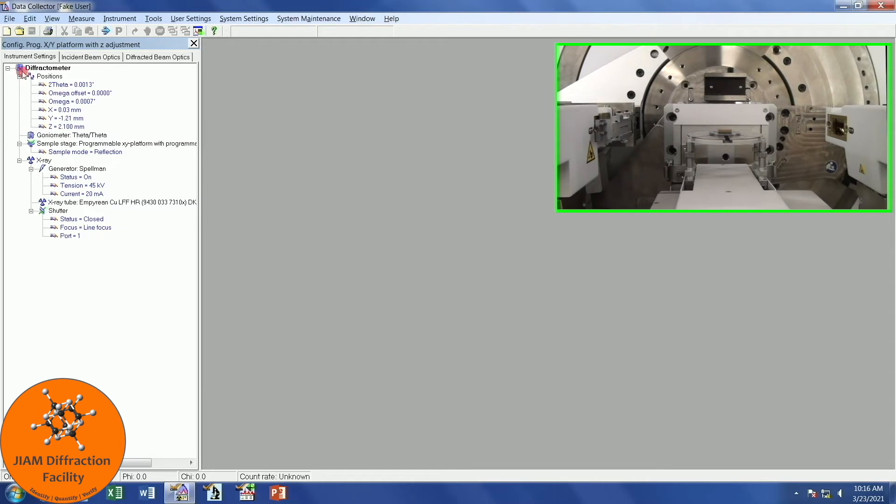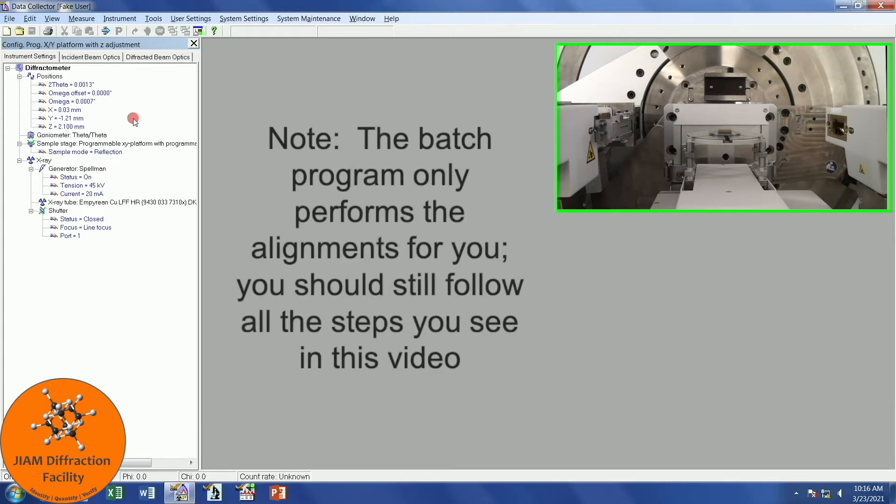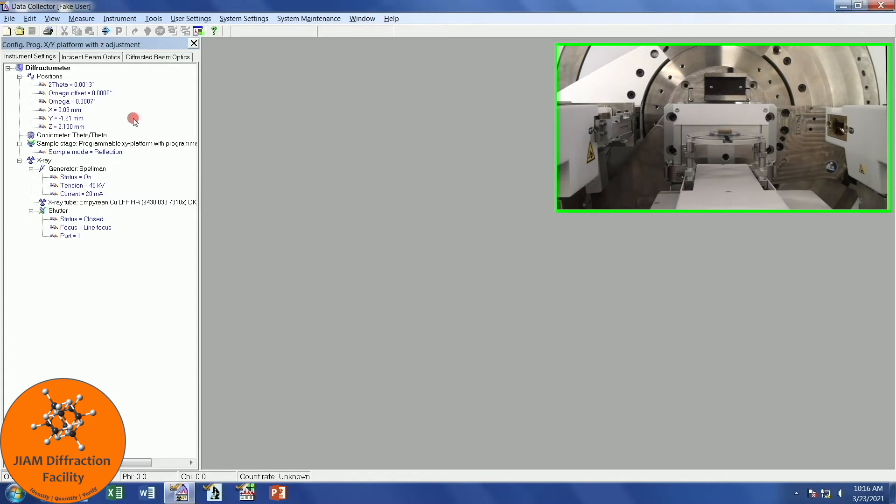Here we see three tabs: Instrument Settings, Incident Beam Optics, and Diffracted Beam Optics. This first tab, you may or may not even need to do anything with this. What I am going to show you here in this video is how to perform alignments using a batch program that carries out all of these steps for you. I have created another video that shows you how to make this batch program, and if you would like to view that, just click the link that should be appearing at the top right of your screen.